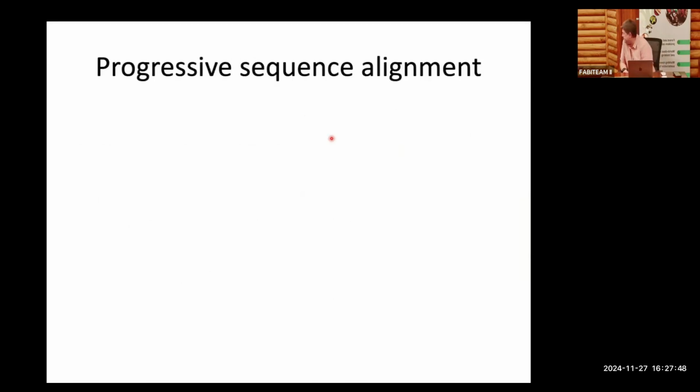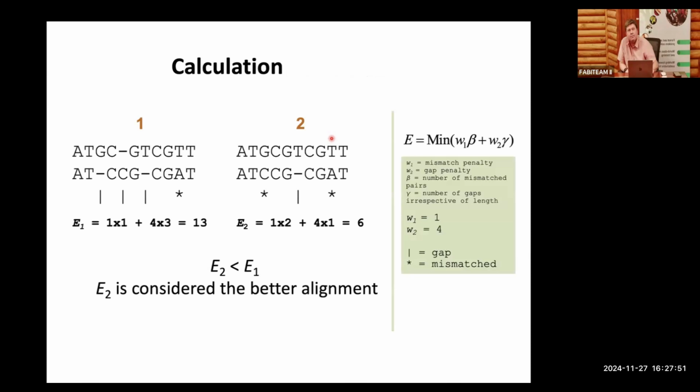Before you go on, there's a question from Hendrik. He's saying that recently he had sequences where both the forward and reverse strands showed a couple of nucleotides at N because of equally likely bases at these positions. Is it best to leave these as N's, or is it better to use ambiguous IUPAC codes for the two possible bases, as they could represent heterozygous bases? Yeah, that is a good question. Thank you, Hendrik. If you don't have confidence in the call, you will leave it as N.